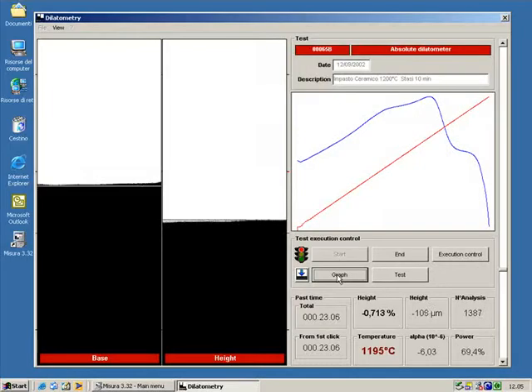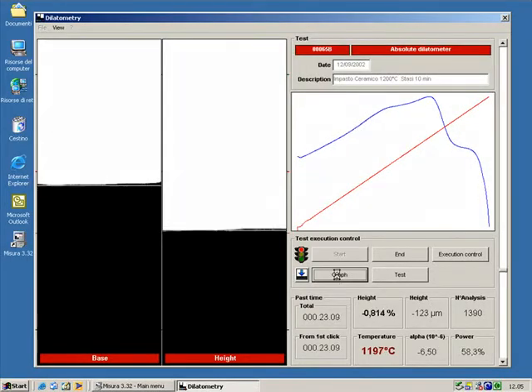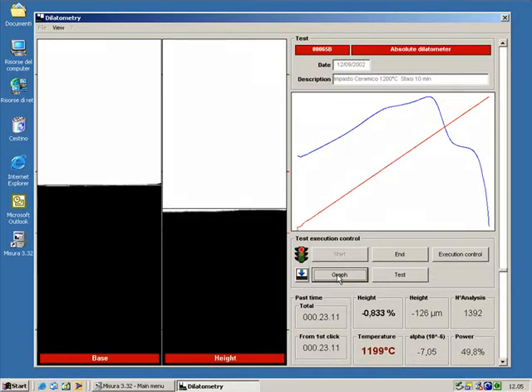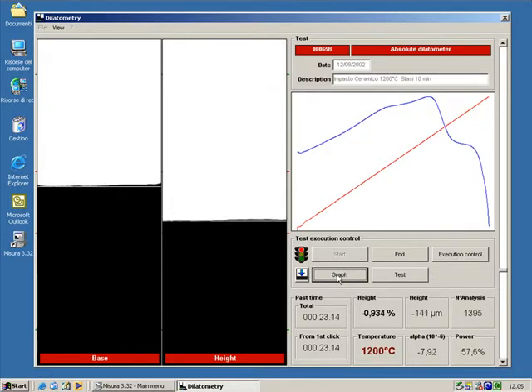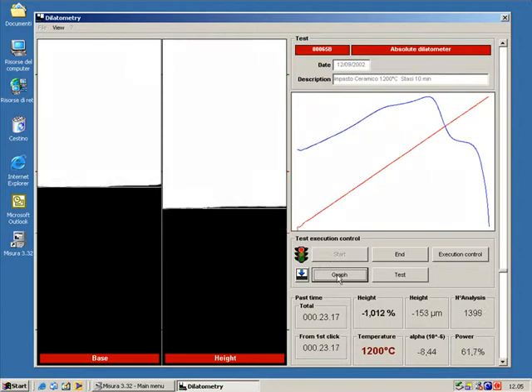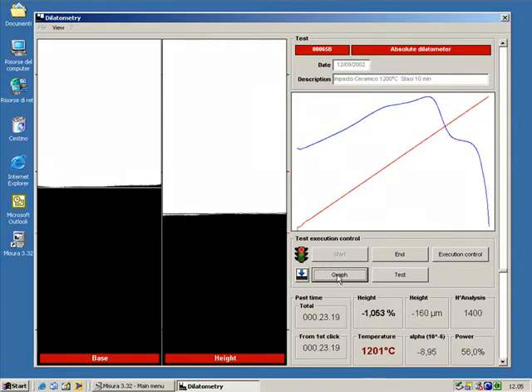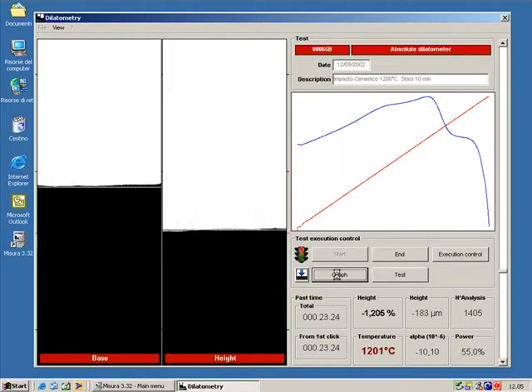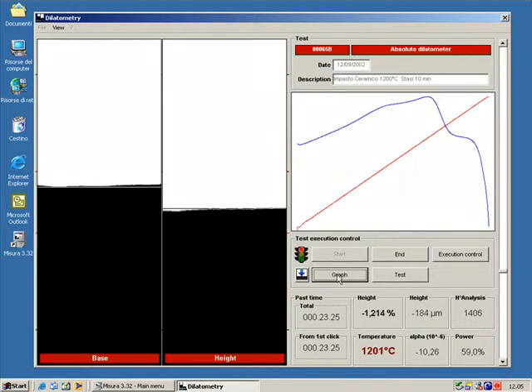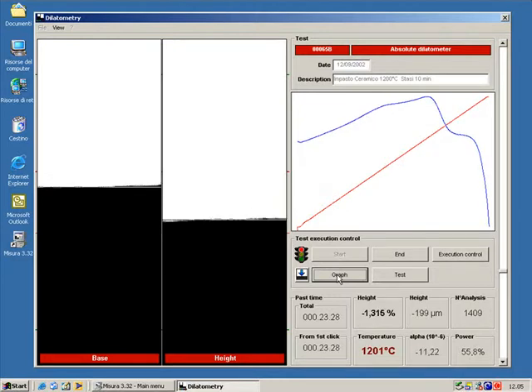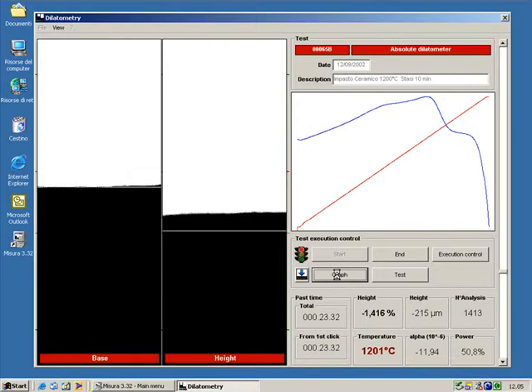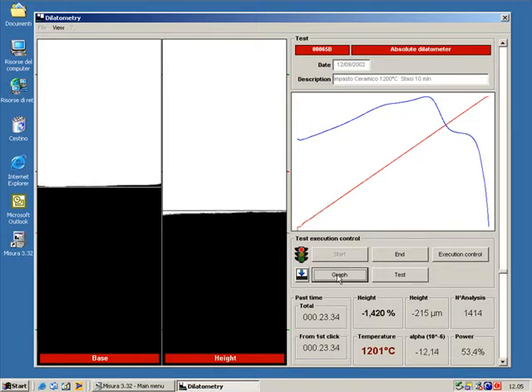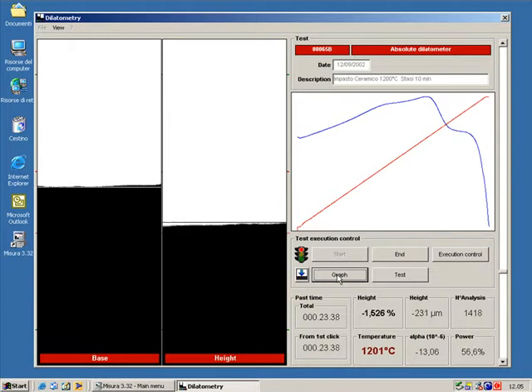This is the main window of the software during the measurement. Here we can follow a sintering test on a ceramic body. The two vertical windows on the left show the images of the top end of the sample and of the sample holding plate. On the right we have the expansion contraction curve, colored in blue, measured on the sample as a function of time, and the temperature curve, colored in red.